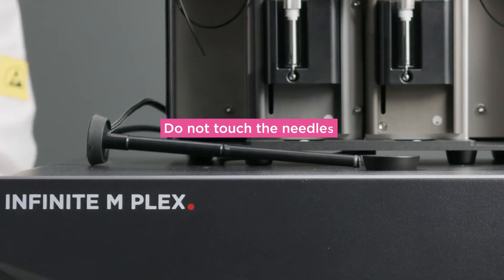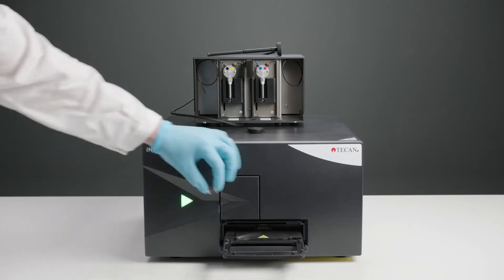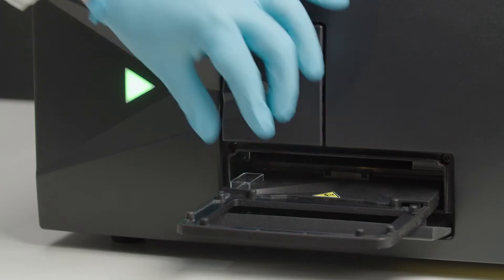Take off the cover. Please do not touch the injector needles to prevent any damage. Put the waste tub on the plate carrier before using the injector module and empty it regularly.